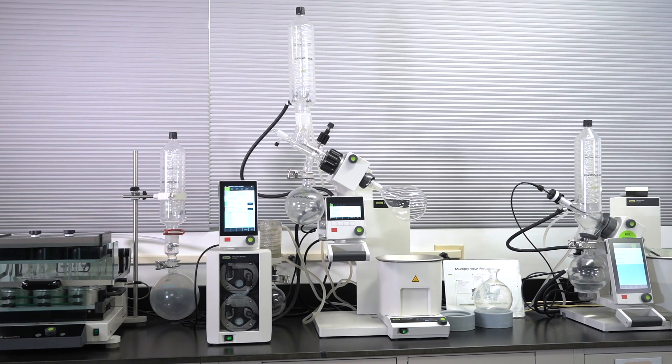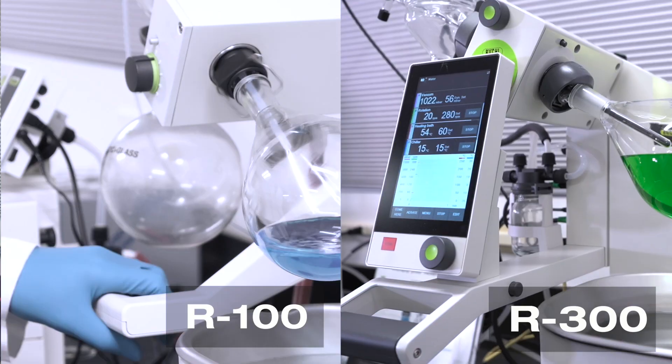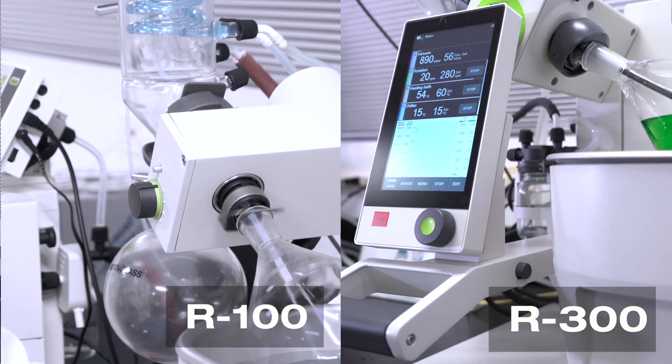The R300 has an electronic hand lift with an adjustable lift depth limiter, while the R100 has a manual lift without a depth limiter.